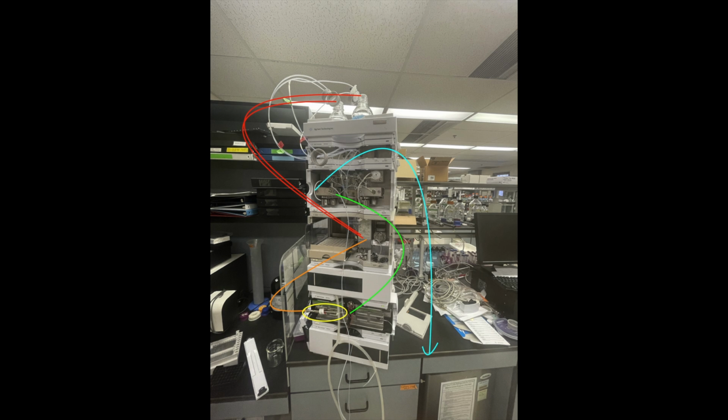And since there's basically only water and the peptides would rather interact with the column, all of the samples stay stuck to the column, and you just have water flowing out the back. But then something that's important to note is that at a specific acetonitrile level, all peptides of the same chemical composition will fall out at the same time.